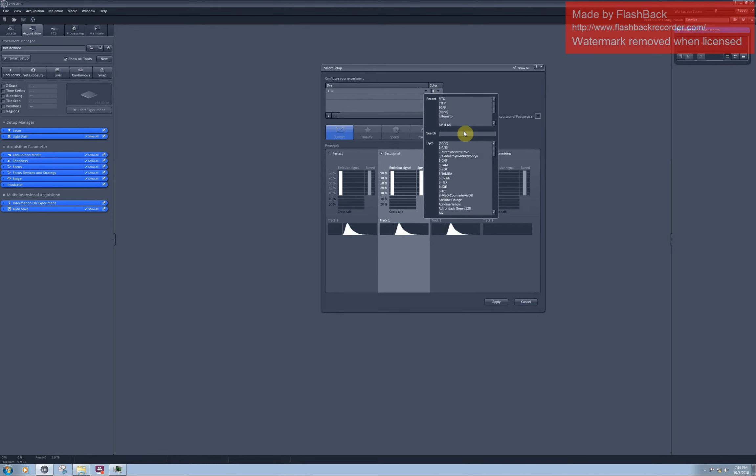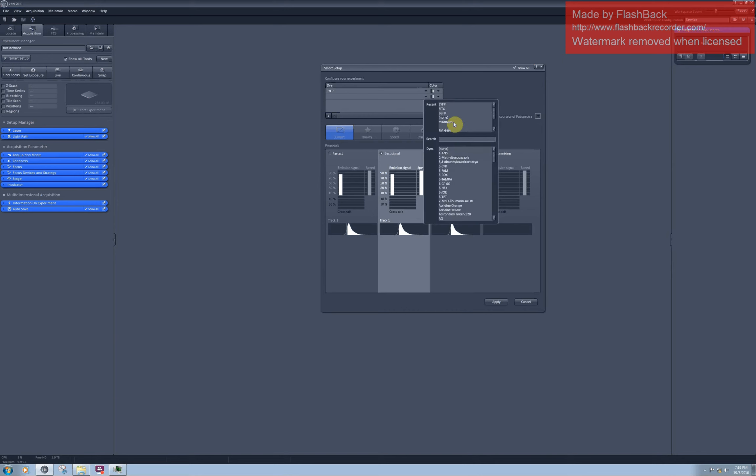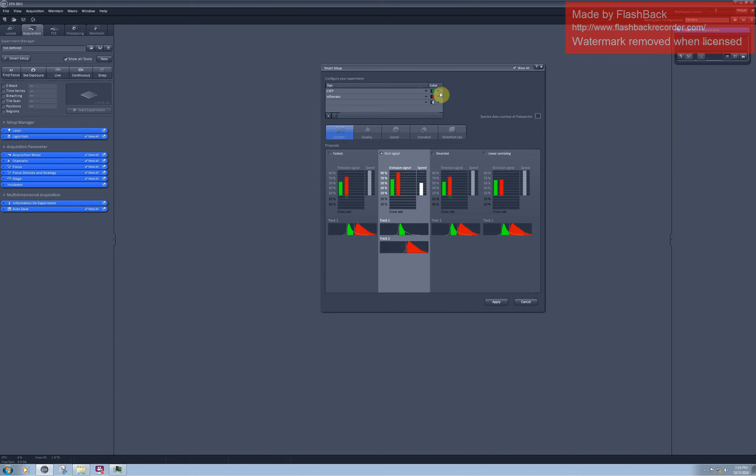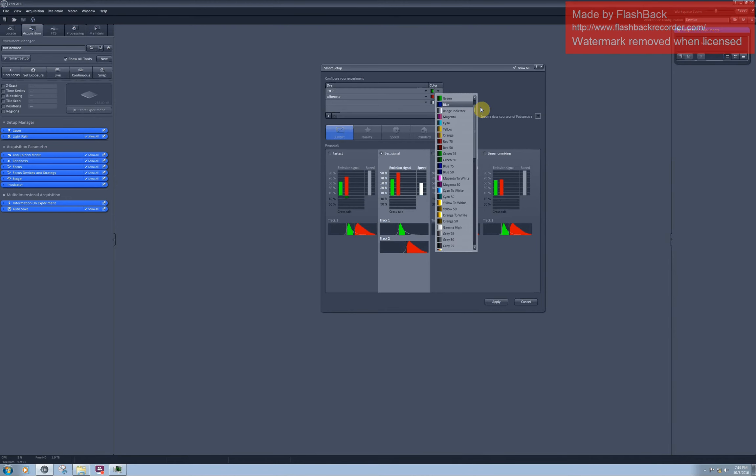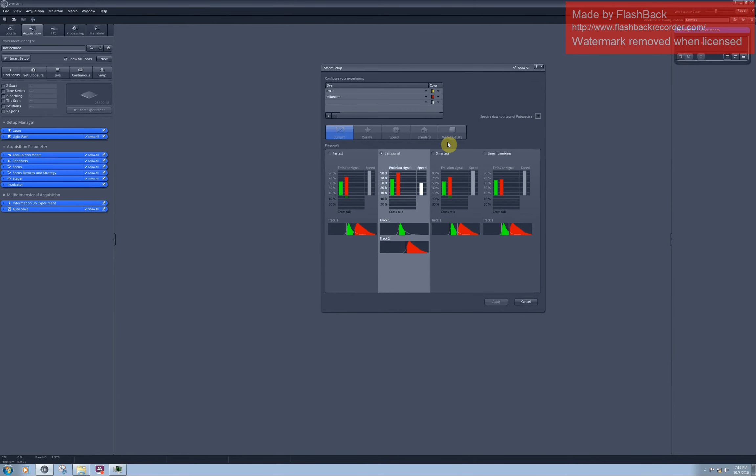I have YFP and red fluorescent protein called tomato in my sample, so just type in the names of the fluorophore. Here's tomato. The PMT detectors in our confocal are colorblind, so it doesn't really matter which color you annotate your intensities with, but I would like to have YFP as yellow.